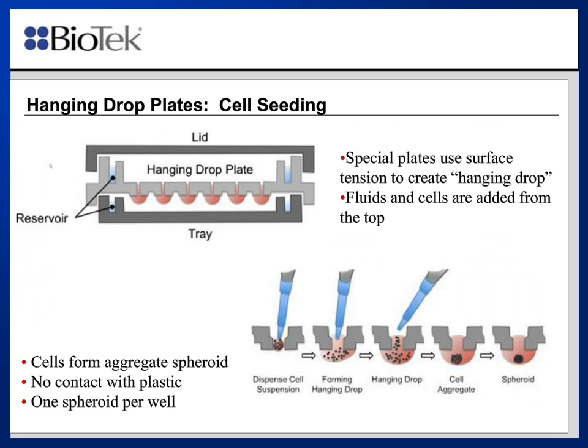The spheroids themselves are self-assembled microscale cell aggregates. They're generated using the Perfecta3D hanging drop plates from 3D Biomatrix and are considered superior models for avascular in vivo microtumors when compared to standard 2D tissue cultures. Using the system, a drop of cell suspension is pipetted, which can be seen in the lower portion of the diagram. The cell suspension forms a stable drop below each well through a small hole in the bottom of each well, where the cells aggregate into spheroids.